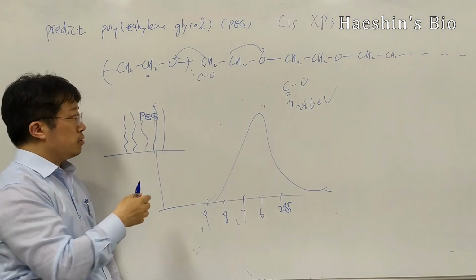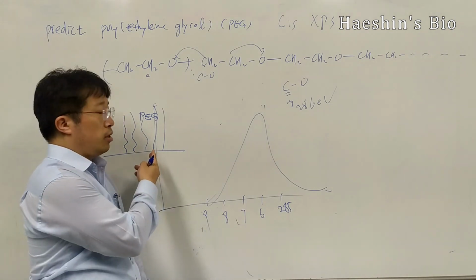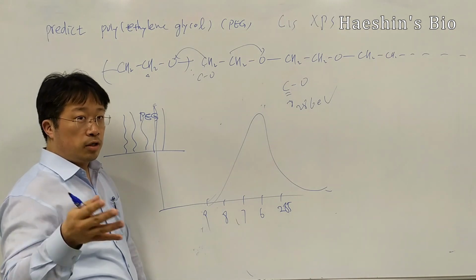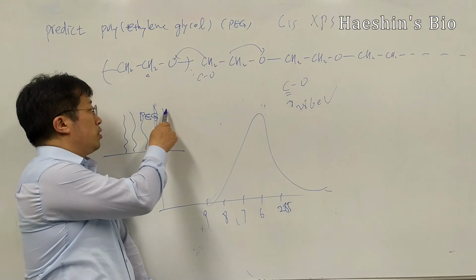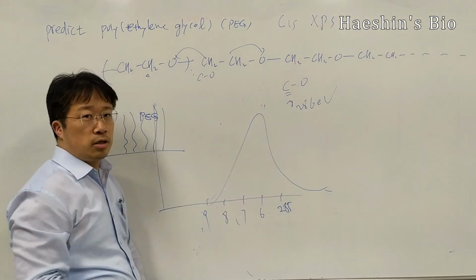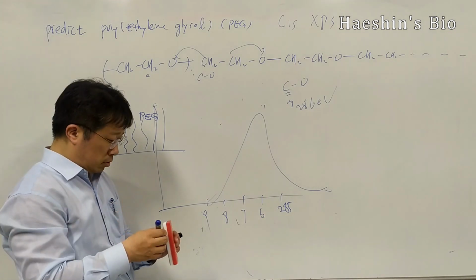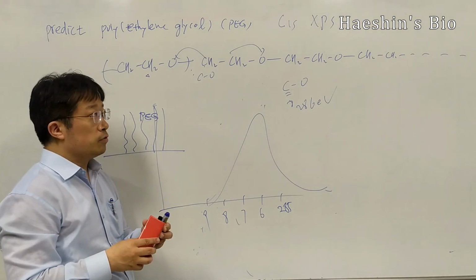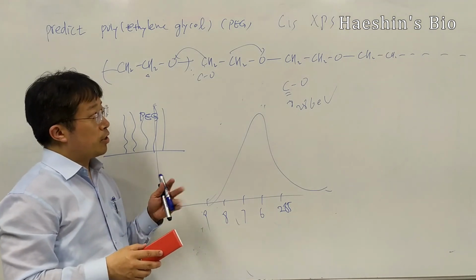Then you take the XPS, which is a frequent case with surfaces where polyethylene glycol is immobilized for many different reasons that I cannot explain for this class. But anyway, for this XPS you think about only a homogeneous single peak. Okay. When you first learn about XPS, this is often the case where you misunderstand and get wrong answers. So this is the right answer.